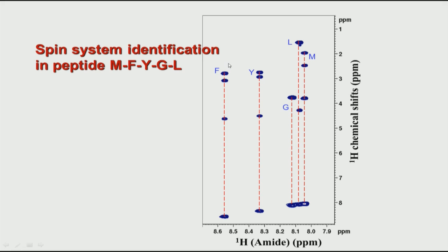that this line is indeed tyrosine and this line is indeed phenylalanine. Then we look at 3 more lines, because we have 3 more amino acids, and we can see that this particular amide line corresponds to glycine, because it has only one peak, and that comes in the region of 3.5 to 4 ppm, and from literature, from the database, we know this should be a glycine. The next line here should be a leucine. The reason being that this peak is alpha, which is not really characteristic. Alpha regions, again you should remember that they are not really characteristic, because they vary with the structure, but what is important is the beta, gamma and the methyl region.